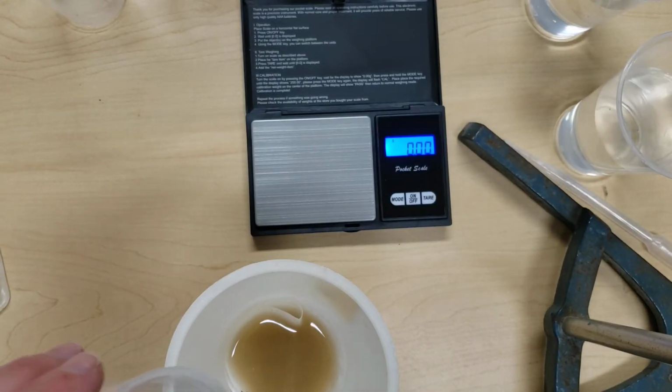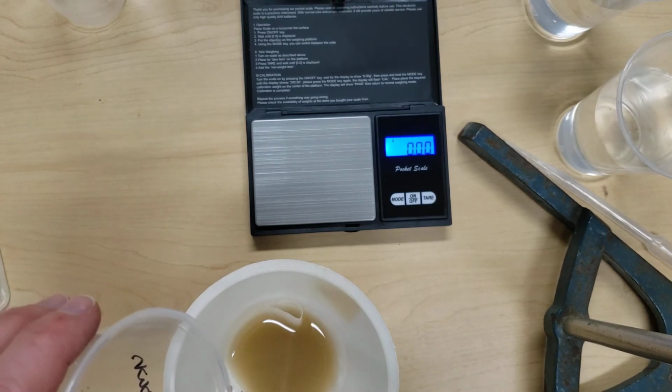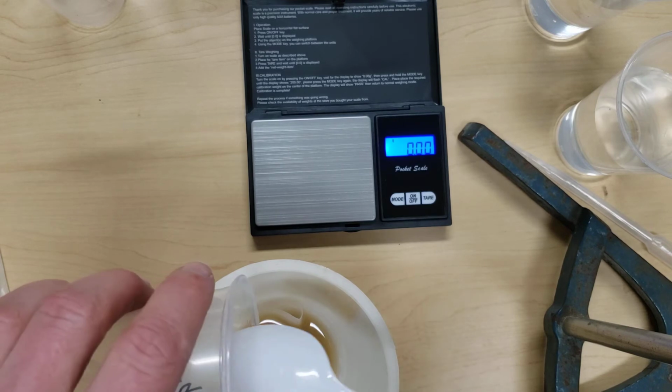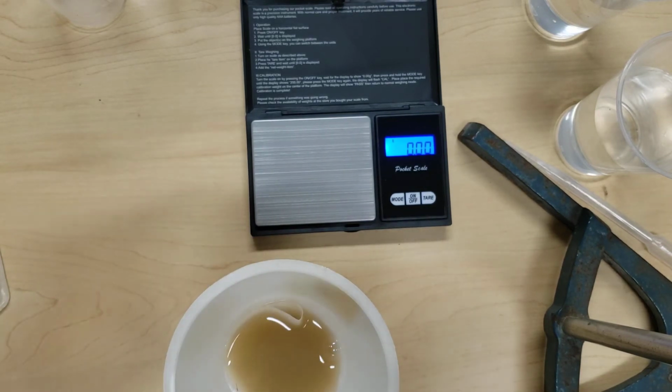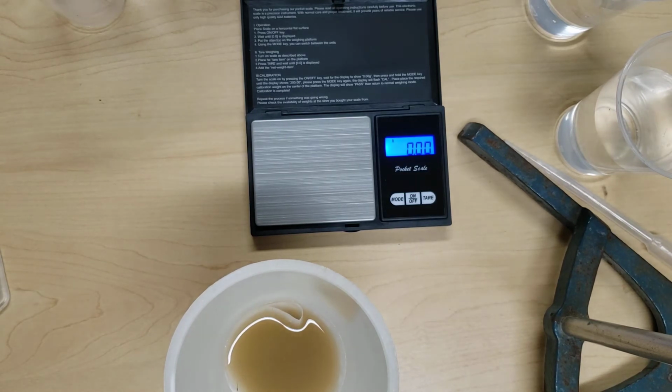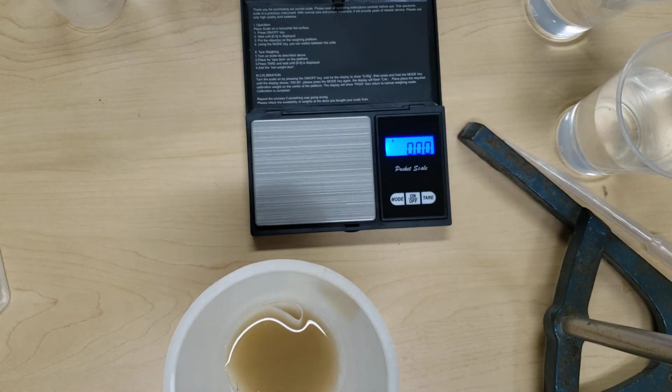Then wait for the liquid to completely leave the funnel and transfer all of that down into the funnel. And again, you do want to be a little patient so that you do a good job with this part of the experiment.